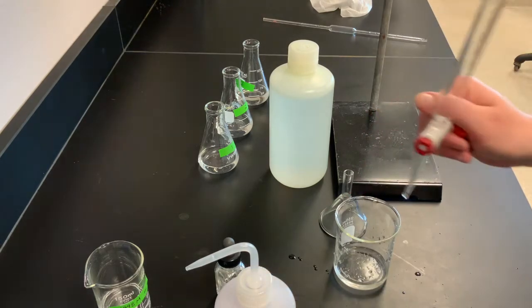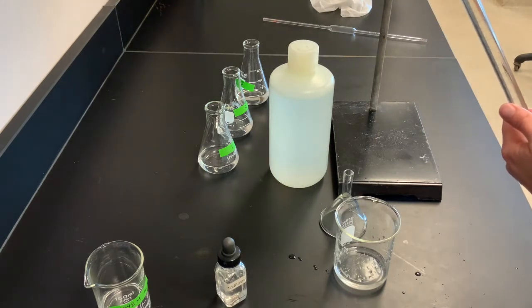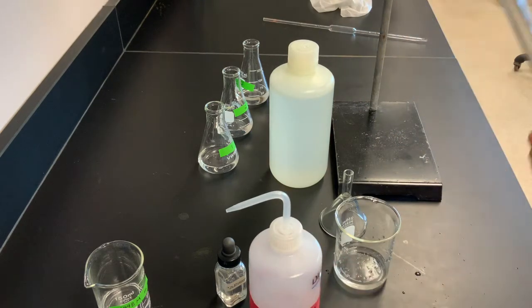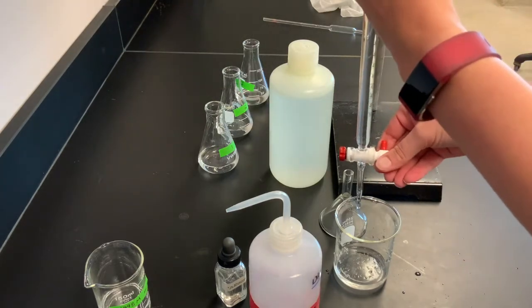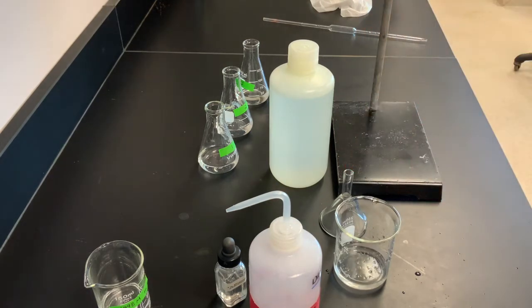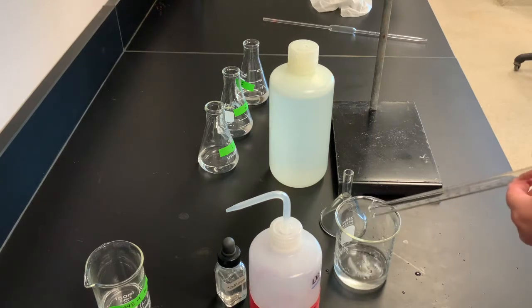So I'm going to do that one more time. Again, I just got a little bit of water in there. I'm twirling it around, and go ahead and let some out the bottom. So that's to get any other dirt or materials out of there. But now what we need to do is condition it.